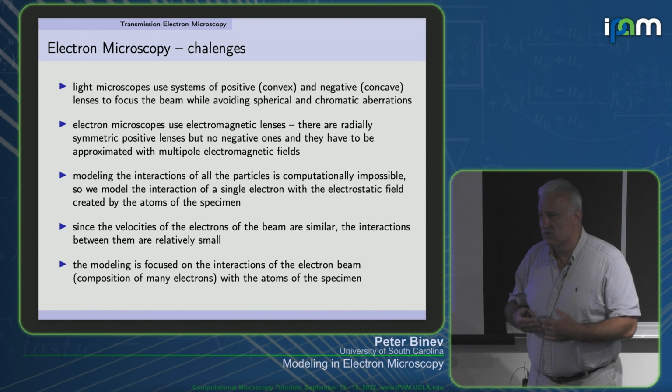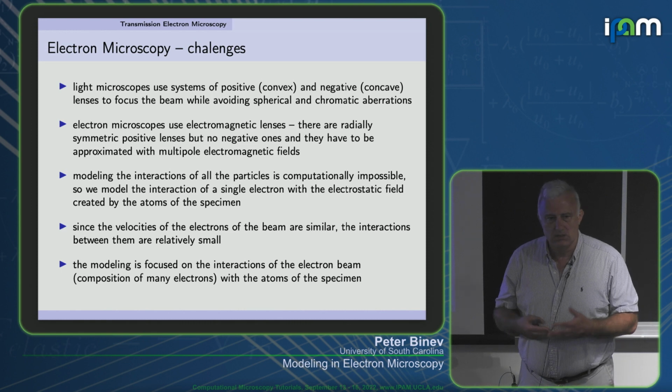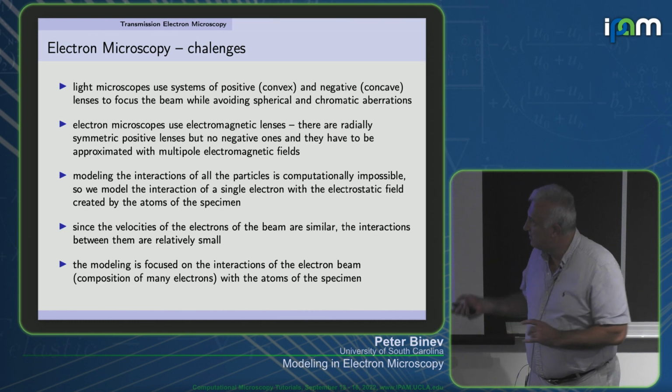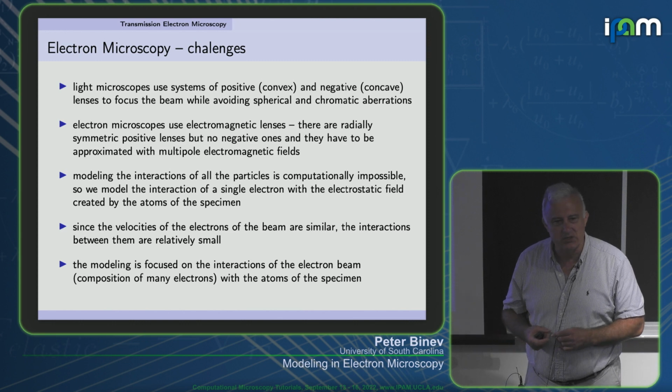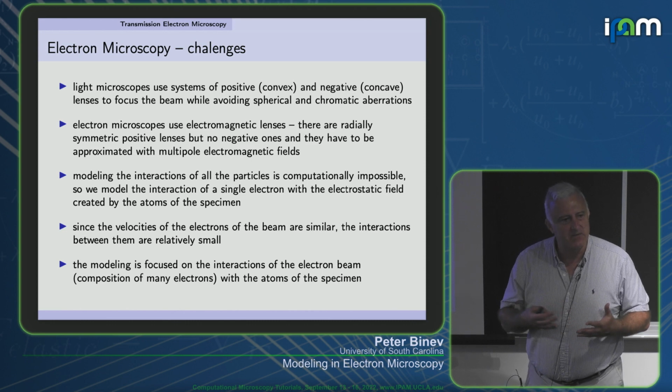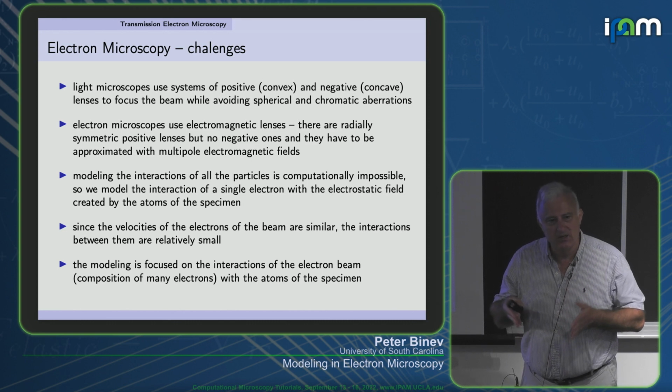The aberration correction is very important because that makes everything well built, especially if we want to make simulations. And often we will assume that everything is very well aligned.